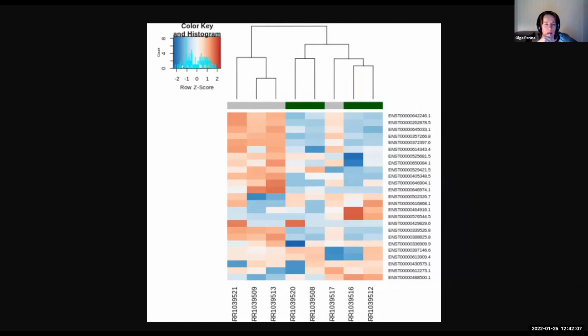Yeah, the number of reads, but they are standardized somehow, I think. And that Z score. It looks like a normal distribution, maybe with some values at -1.